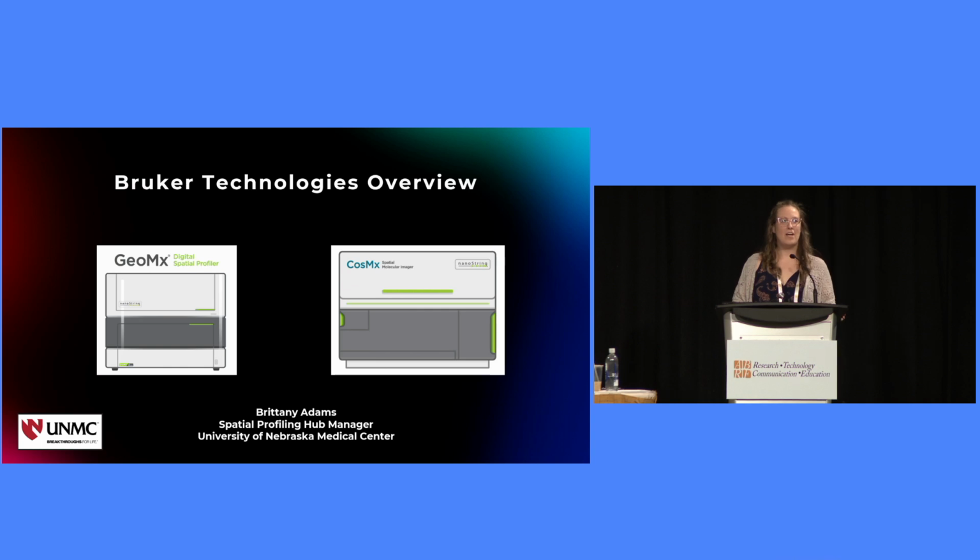Okay, so now we're going to start our session about navigating different spatial technologies. The reason we wanted to do this session is because we know there's a bunch of spatial technologies that have been coming on pretty quickly in the industry, and they all have their different strengths and weaknesses. So we want to go through them so you know which experiments are going to work well on which devices.